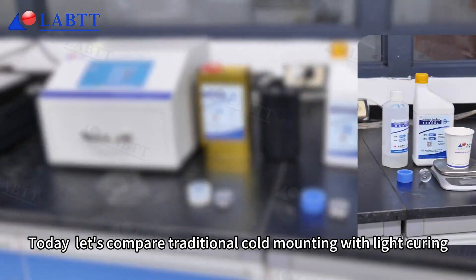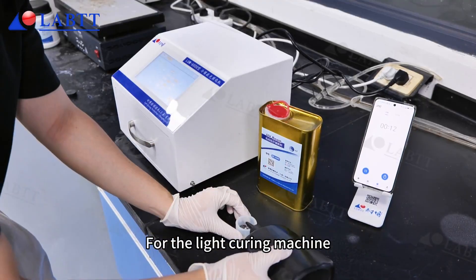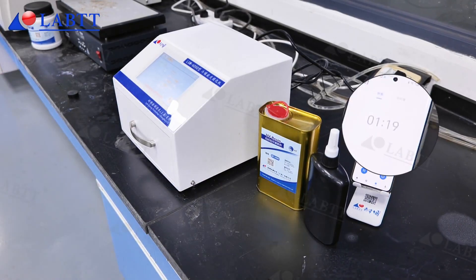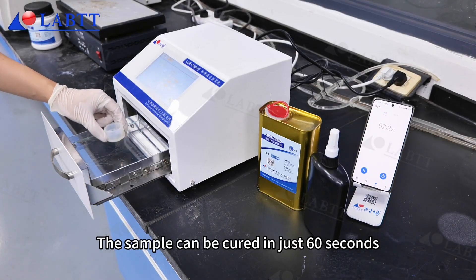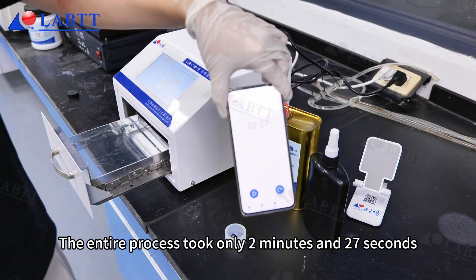Today, let's compare traditional cold mounting with light curing. For the light curing machine, pour in the mounting material, let it sit for a while, and then you can start curing. The sample can be cured in just 60 seconds. The entire process took only 2 minutes and 27 seconds.